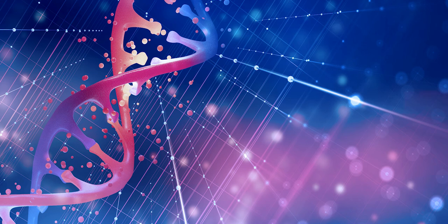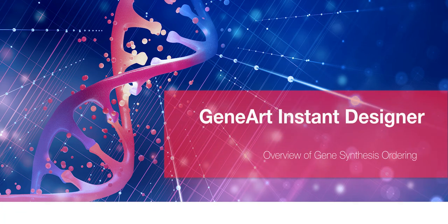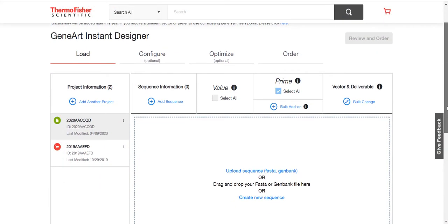In this video, we'll give an overview of the GeneArt Instant Designer ordering portal, as well as the improvements we've made to make ordering genes that much easier when compared to the classic GeneArt ordering portal. So right off the bat, you can see that this is a much cleaner, simpler interface. There's load, configure, optimize, order tabs at the top.